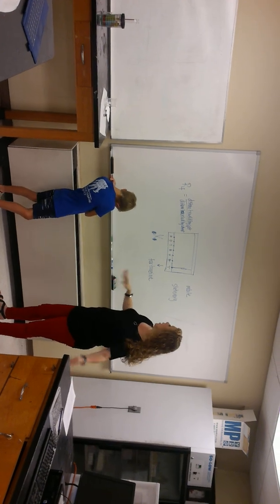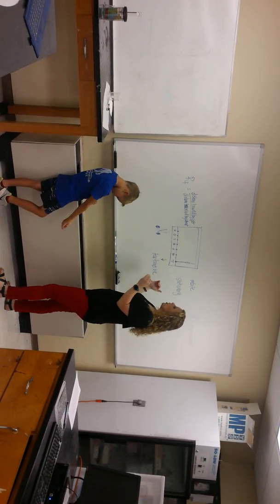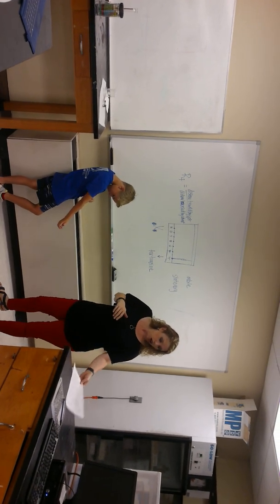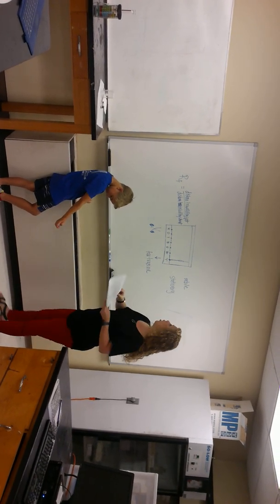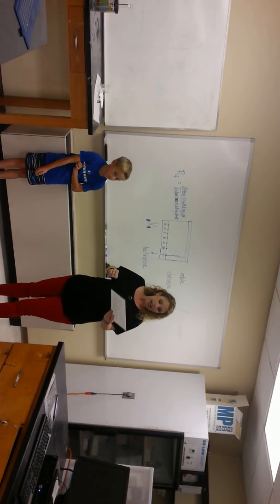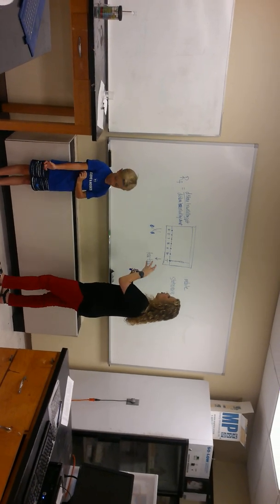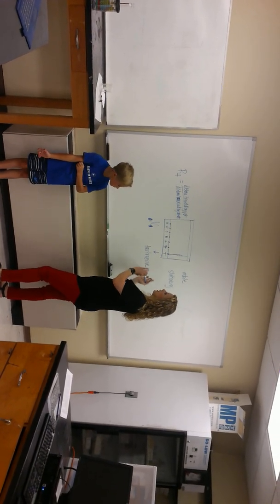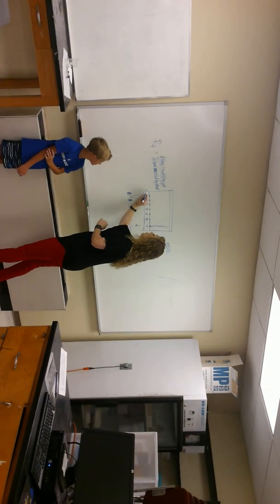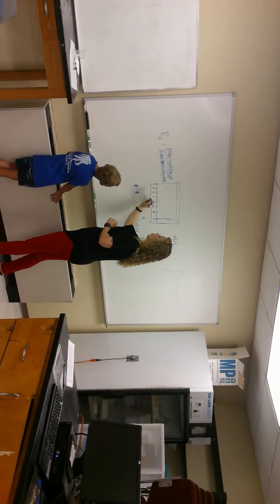Now, I've already talked about dotting the chromatography paper, but one other thing I want to talk about, once you get it into the solvent, and it tells you your mobile phase, your solvent is 1% sodium chloride solution. One of the things that you need to be careful of is this. Once you put your solvent into the test tube, you've got to be sure that the solvent line doesn't come above where your spots are.